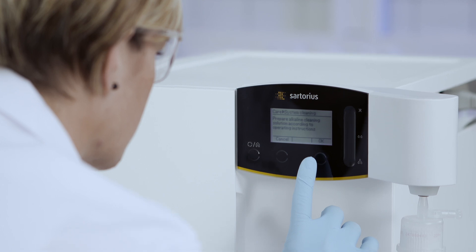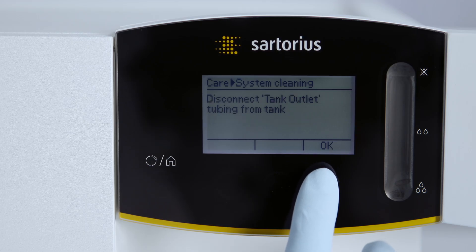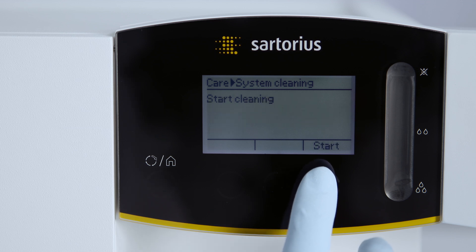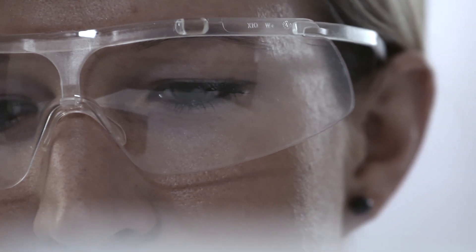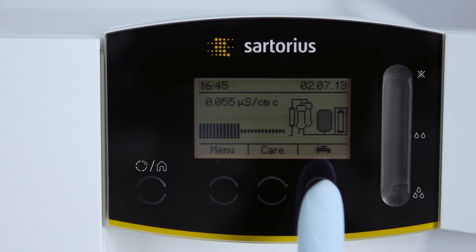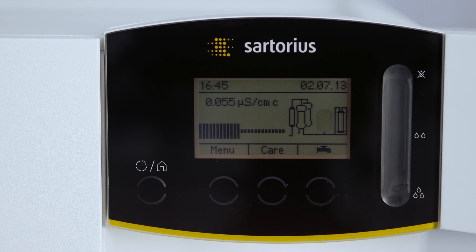The easy to clean unique glass display with touch screen function enables an intuitive navigation of the menu, even with gloves. Forget about boring user manuals and focus on the essentials, your lab applications. The system guides you step-by-step through every menu option.